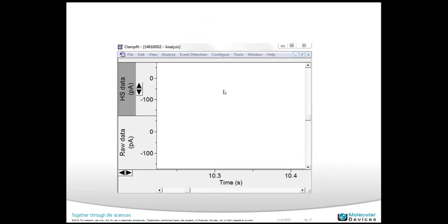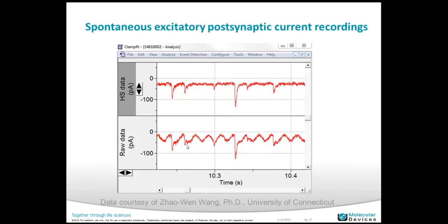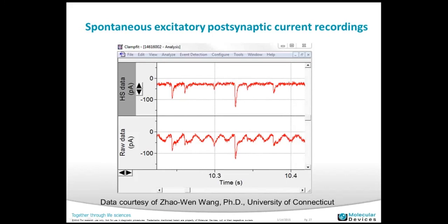Are you ready for another application? Here are minis — I showed this before — sitting on top of the 60 Hz noise. It's hard to see how many events there are in the raw data. But after Hum Silencer application, you can easily count: one, two, three, four, five, six — there are six events. This is a very beautiful mini recording obtained in Dr. Johan Wong's lab at the University of Connecticut.